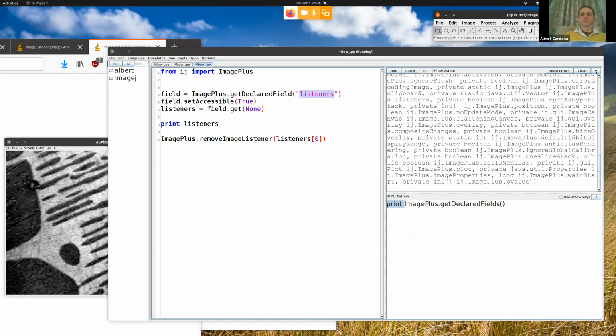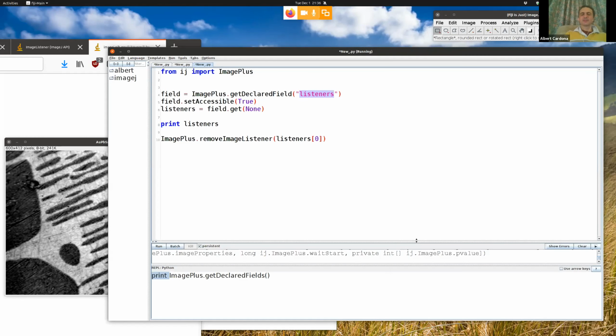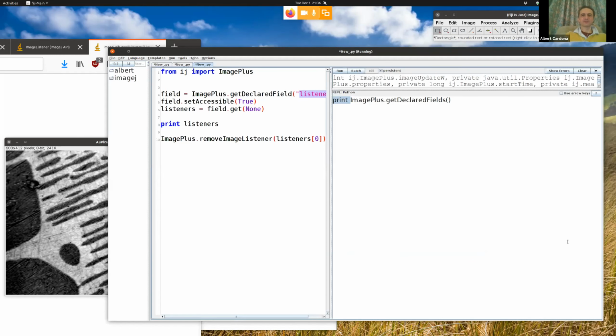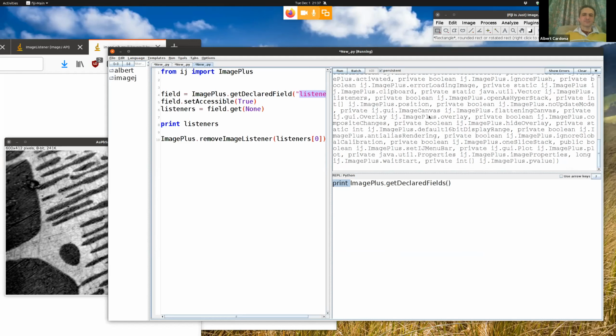Okay, right. So environment, you may have it like this, right? You have a window at the bottom. That's right. So if you push this little arrow, you don't have to, but I find it more convenient because screens tend to be wider rather than taller. As I push the little arrow, you get this. And then notice there's a little persistent checkbox. Oh, the persistent. Okay.